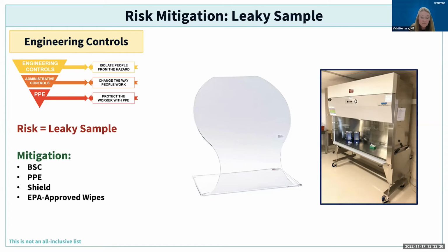And if that's not, could you use a bag to hold the specimen and then carefully place it on an absorbent pad? Again, making sure that you have appropriate PPE. If you have a biosafety cabinet, again, that's going to be one of your best defenses in this situation. But perhaps you can put it on an absorbent pad and then you can use an EPA approved wipe to pick up the tube and then completely wipe that tube down before you start any testing. So making sure that that risk is mitigated or controlled in the best way that you can before you move on to the next task. Next slide, please.